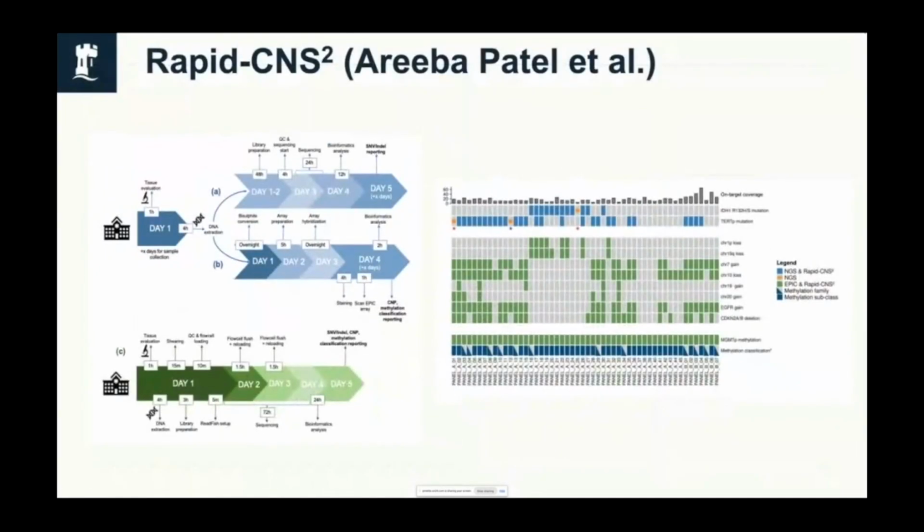And so they proposed that we should be able to do this from nanopore data alone. And we used a targeting approach, an adaptive sampling approach, to allow us to look at specific genes in more detail and to come up with this accelerated process. And what we found was, yes, in 3 days in this case, using a GridION, it was possible to get a complete molecular classification of a tumour addressing all of these specific questions about it in a single assay.